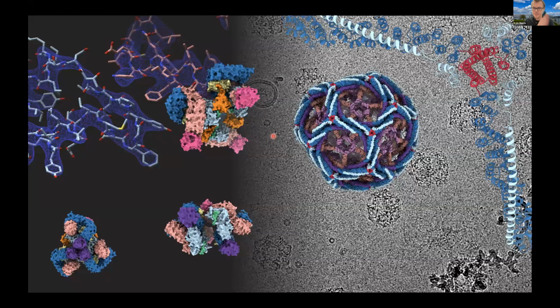This is my background, and this is cryo-EM. We are interested in taking pictures of molecules frozen in ice, and from these images, we can reconstruct what could be considered, at the very least, beautiful three-dimensional representations of biological molecules. So these are some that I've determined when I was a bit more deep into research exclusively, and within these models, what we're actually determining is seen in this mesh here.